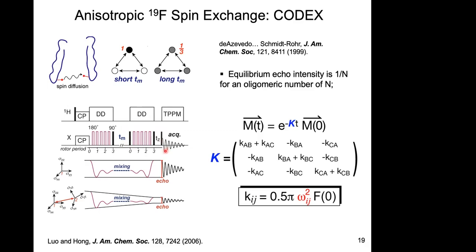That is called a stimulated echo. And if that's the case, nothing interesting is happening. But if you do the real dephasing experiment where TM is long and TZ is short, and the molecule is either rotating, slowly reorienting, or one fluorine is close to a few other fluorines, the magnetization will transfer.